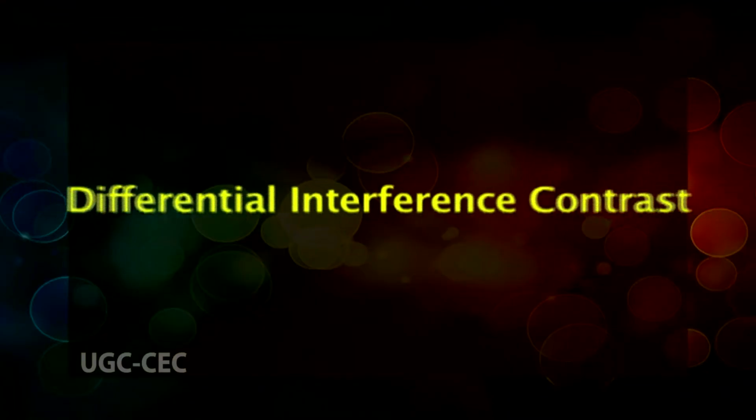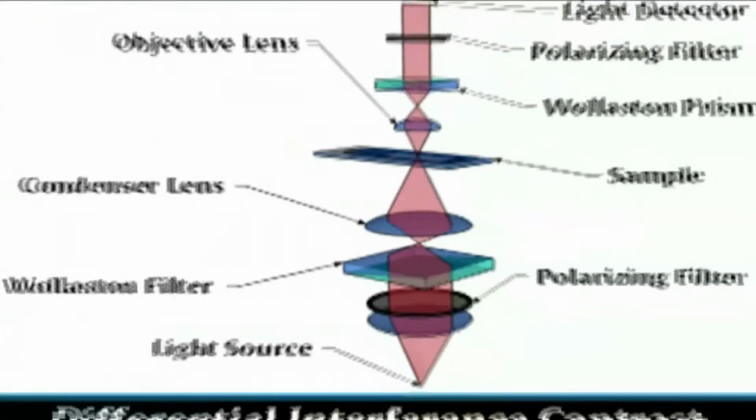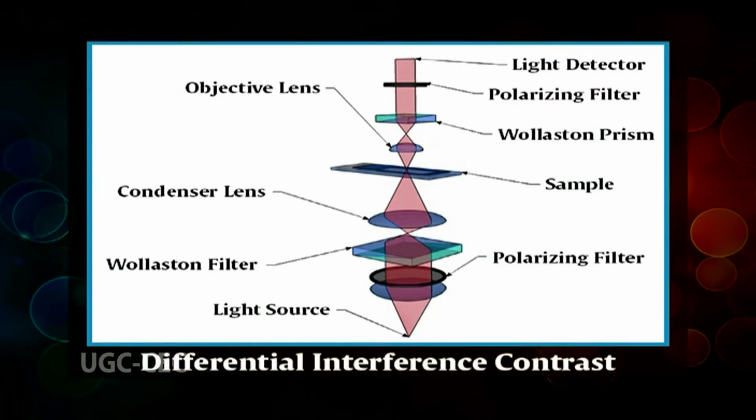Polarized light microscopy can be used to measure the amount of retardation that occurs in each direction and so give information about the molecular structure of the birefringent objects. Fifth is differential interference contrast microscopy. In this complex form of polarized light microscopy, two slightly separate plane polarized beams of light are used to create a 3D-like image with shades of grey.